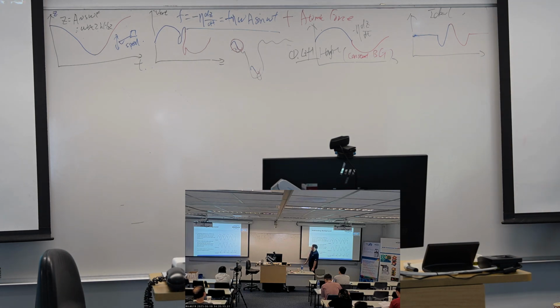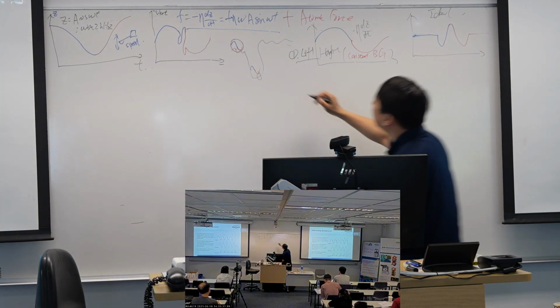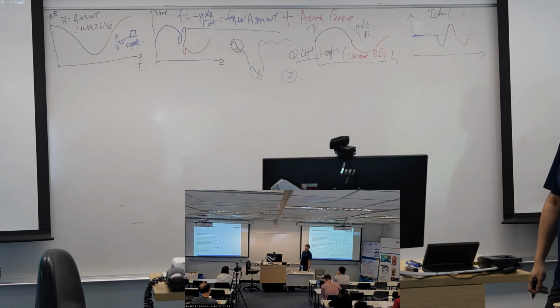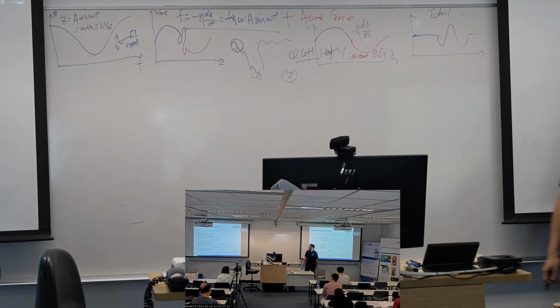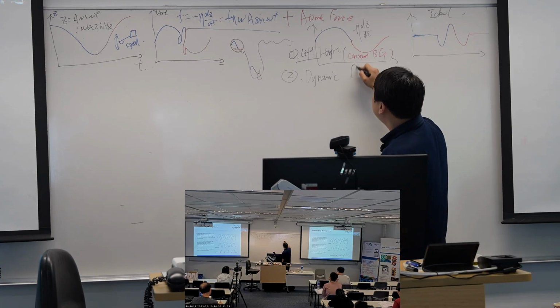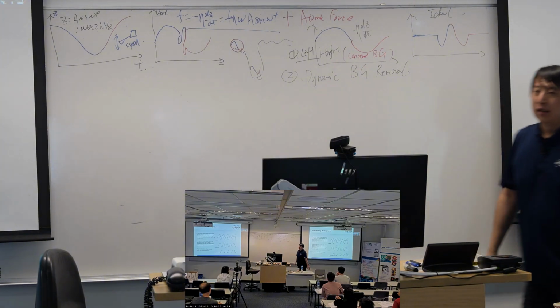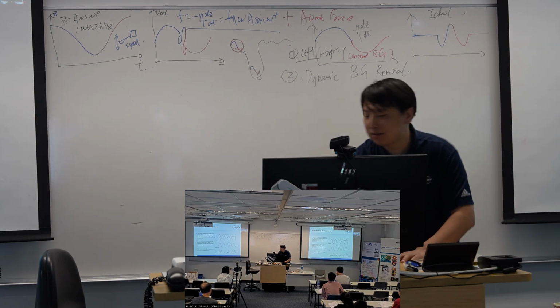So Bruker provides another idea. It's not opened by default, but we can try it this afternoon. It is called dynamic background removal. And the dynamic background removal is pure science. It's pure mathematics. Its idea is this.